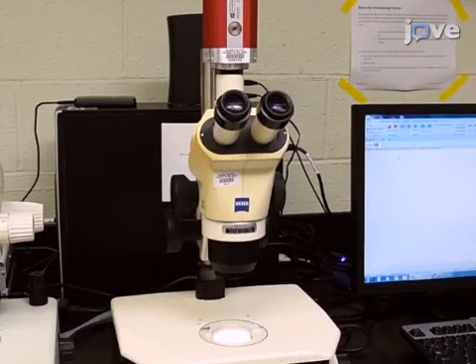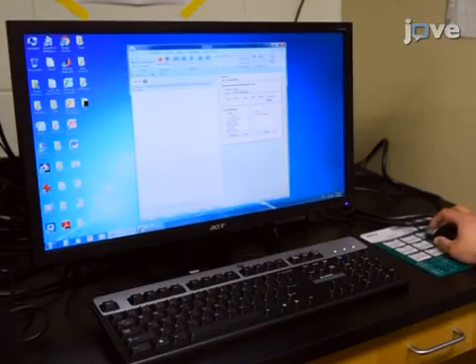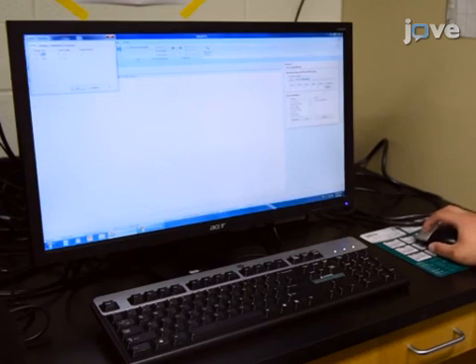Begin by obtaining a stereo microscope and digital CCD camera as well as a computer with digital video recording software and computer vision software for the C. elegans swim behavior analysis.